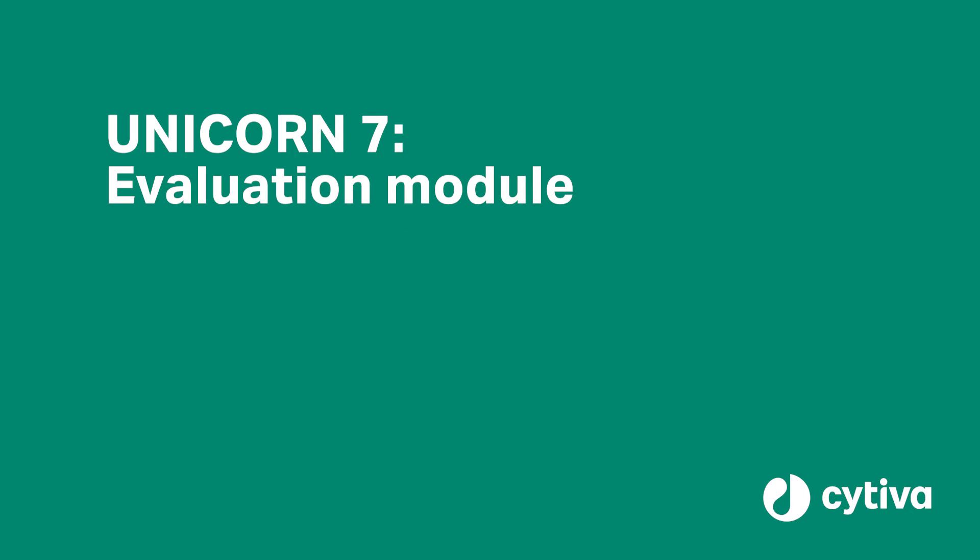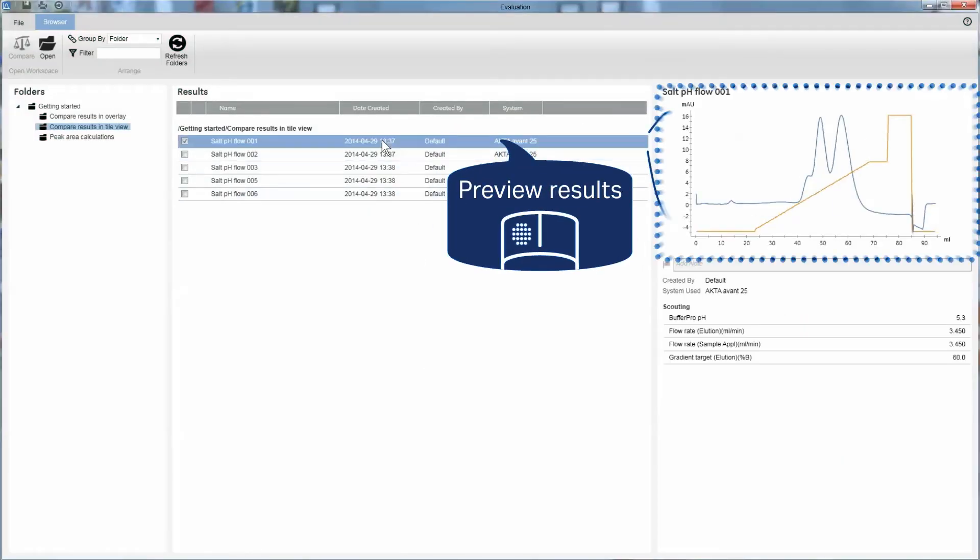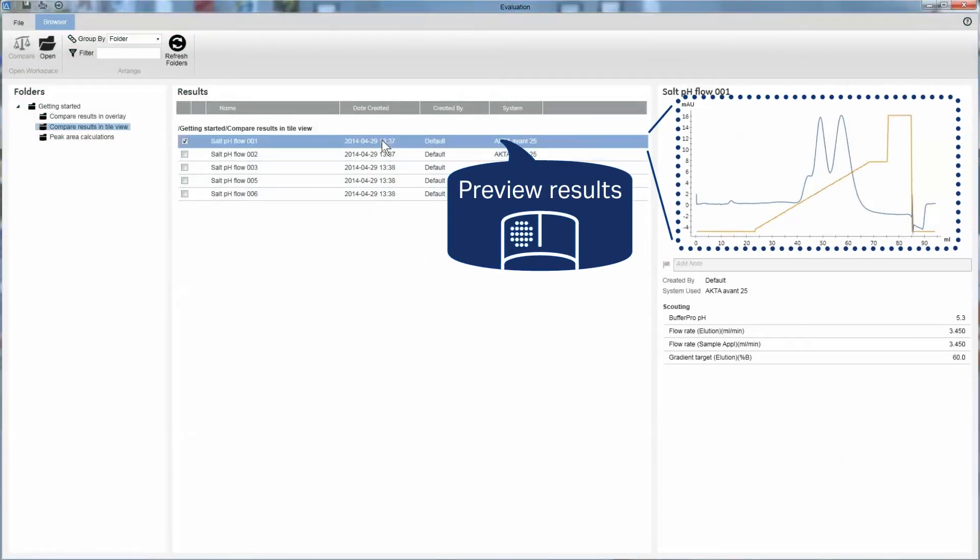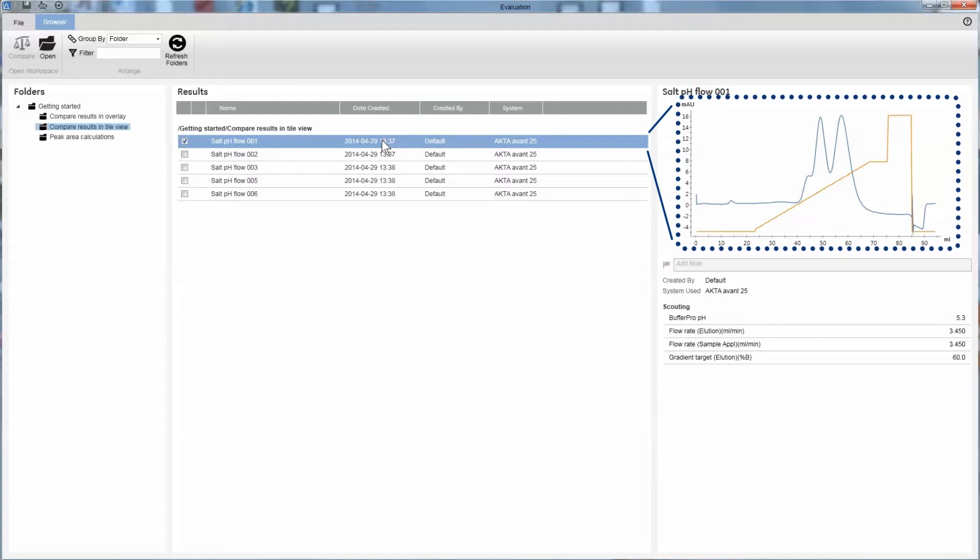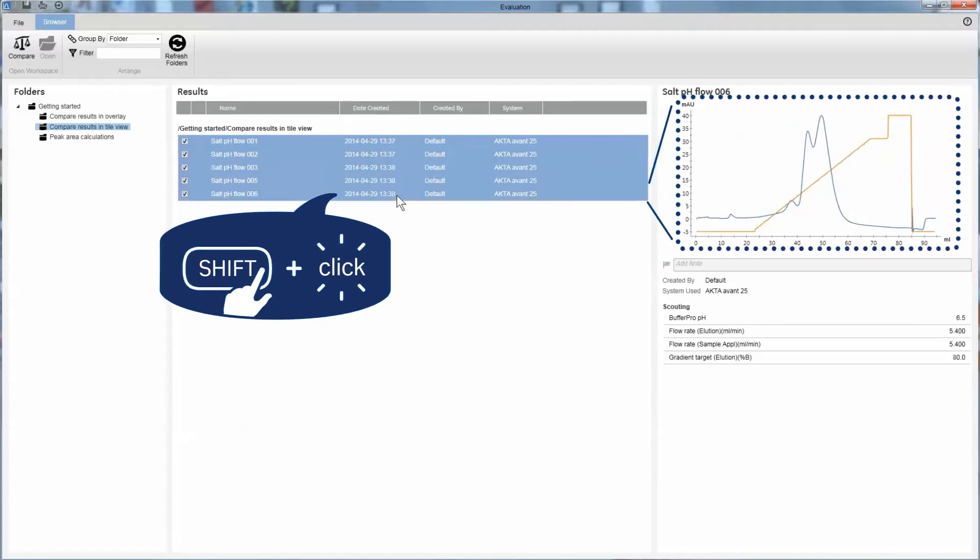Find the optimal separation conditions quickly by comparing your results in the Unicorn 7 software. You can select any number of results to compare.